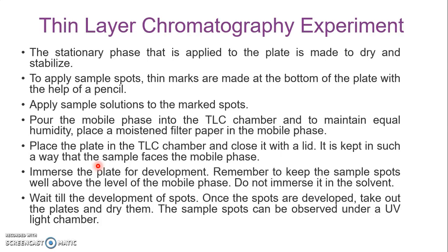phase. Depending on capillary action, the solvent along with the components moves upward in the adsorbing medium, and depending on the rate of adsorption, or the force of attraction between the stationary phase and the mobile phase, the components are separated as different spots.